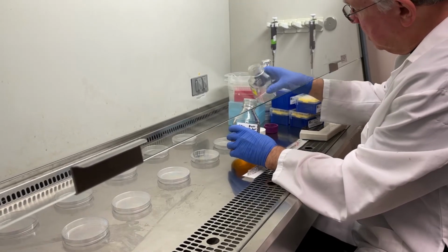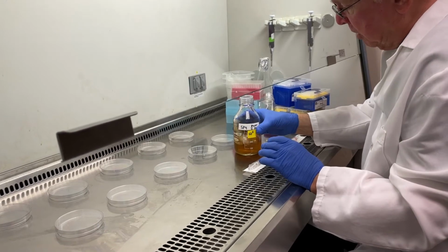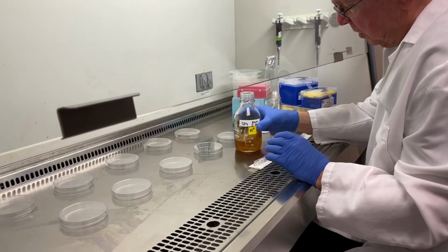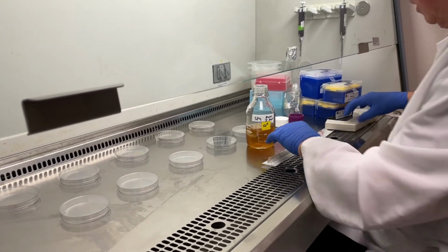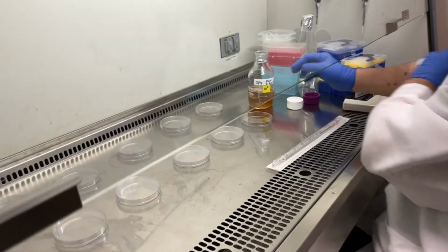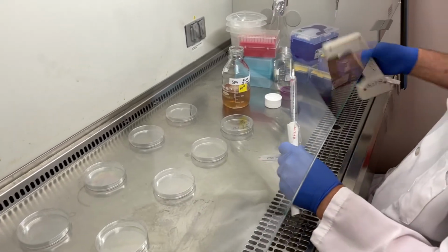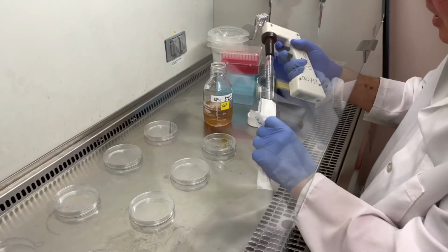Of course, this will create bubbles. You want to avoid bubbles throughout the whole procedure, but by this sort of gentle swirling, you can minimize that. People can pour from these, but there's a tendency to get enormous numbers of bubbles. To avoid that, we deliver through a pipette.